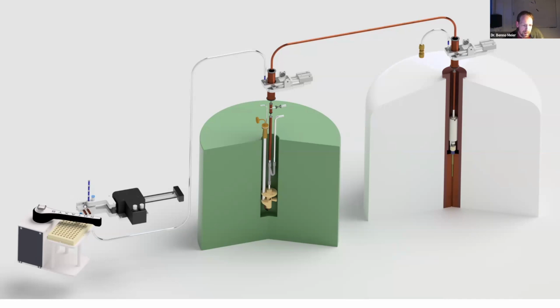And then once that has happened, then we can fill the bullet with liquid from this well plate. It's a 96 well plate. And then, and this is something we learned the hard way, we have to freeze the material while the bullet is in position. So any attempts of ours to move the bullet while being liquid always led to a lot of frustration. So at the end, we decided we freeze it in position.